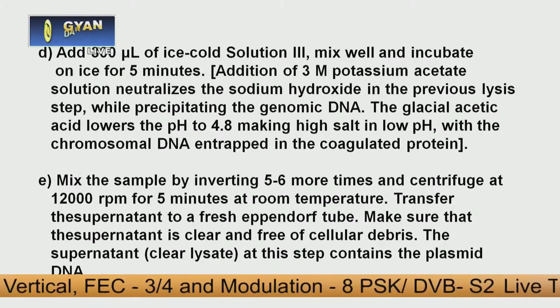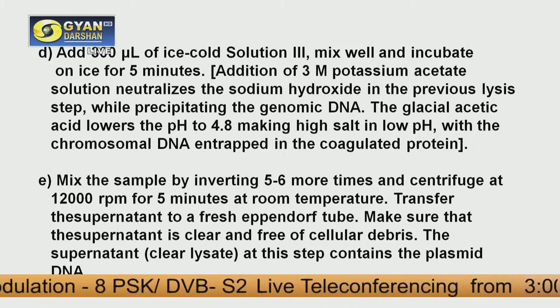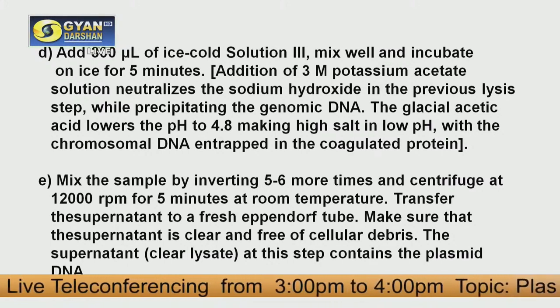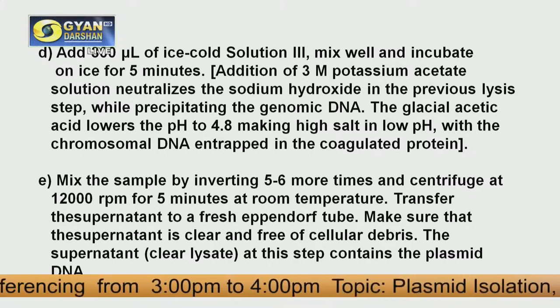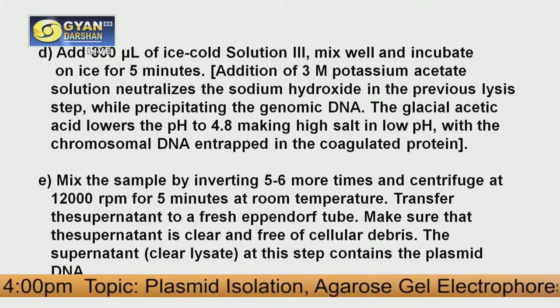Third step, now you have to add solution 3. This is also ice cold. 300 microliter of solution 3. Again you mix well as I have shown you. Incubate on ice for 5 minutes and then you have to centrifuge it.